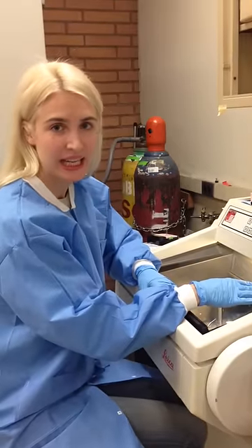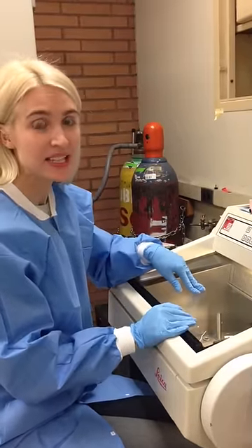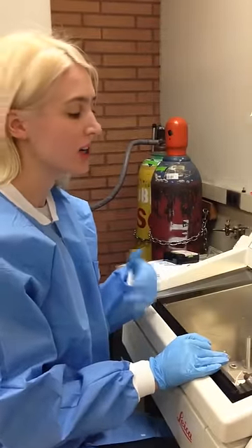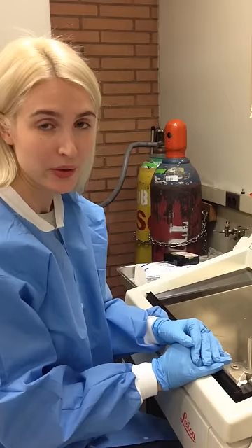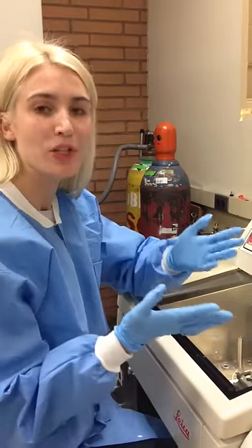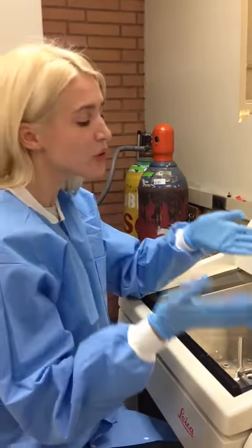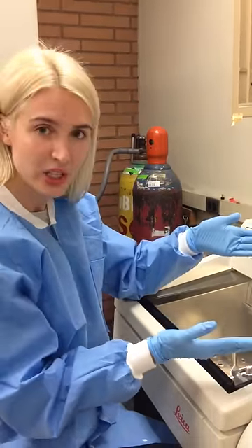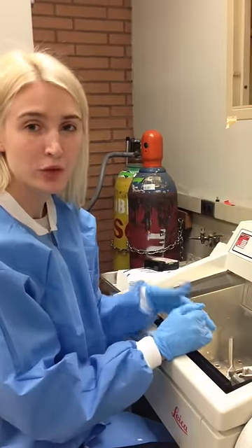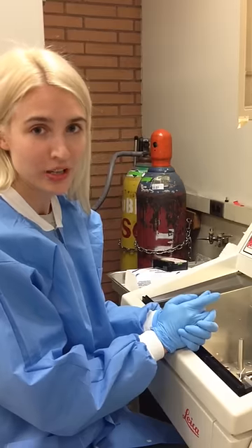Hey everyone, this is me working today with a cryostat and I am preparing the sample for doing the immunohistochemistry. As I've explained before, my project is to study the microhemorrhages of the brain. We're going to stain different proteins that come out with the blood into the brain, and in order to develop a protocol, I'm doing the training right now.